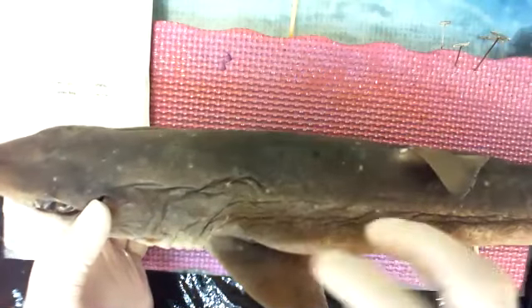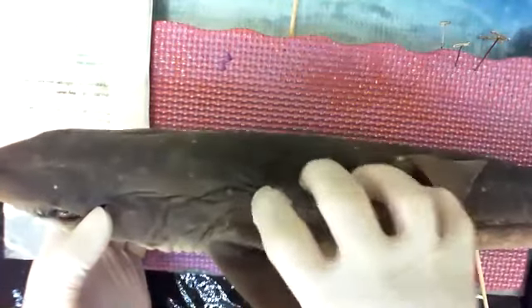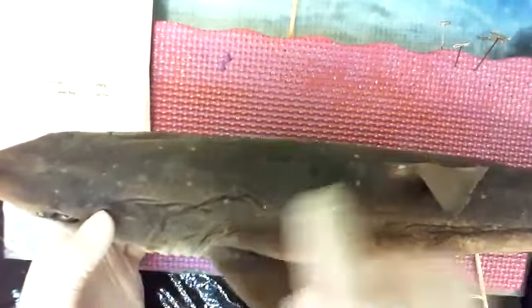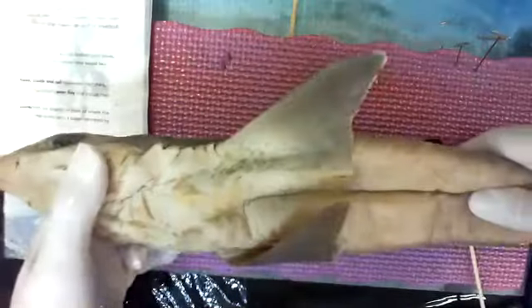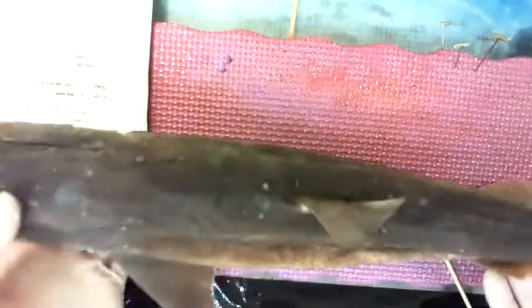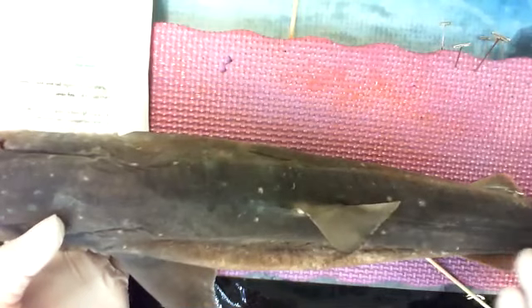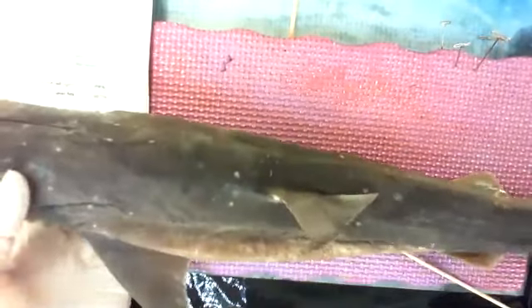So the benefit of having an armor-like skin is that you saw when you tried to put the pin in, if another shark actually bit at it, it would be protected to an extent. Right? Skin color, there's a reason that they're typically gray on the top, white on the bottom, right? If you're a shark and you're only 2 feet long, you're not the biggest fish in the sea. There are a lot of bigger fish. A lot of those bigger fish like to hang out above you. So you find a lot of small fish towards the bottom, or things that get eaten towards the bottom, and then more of the predators stay up a little bit higher. Not always the case, but usually.